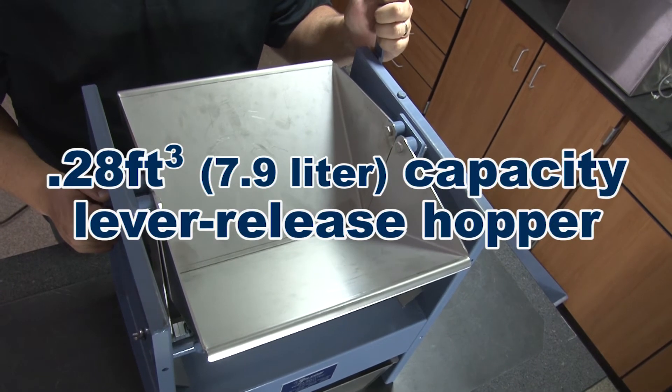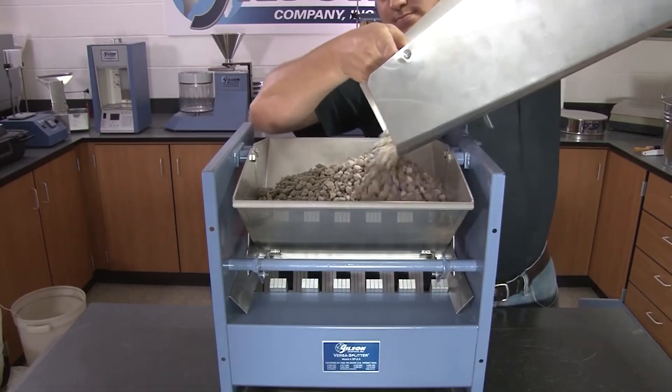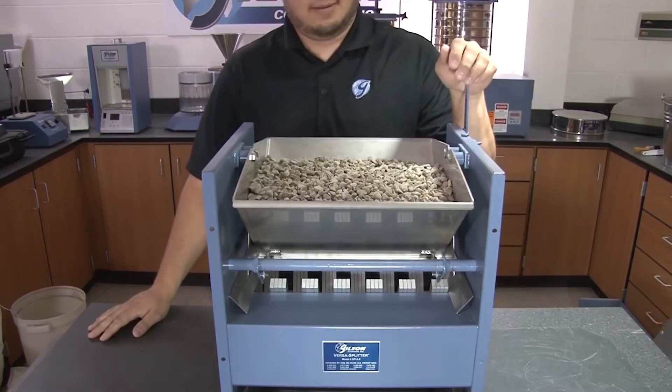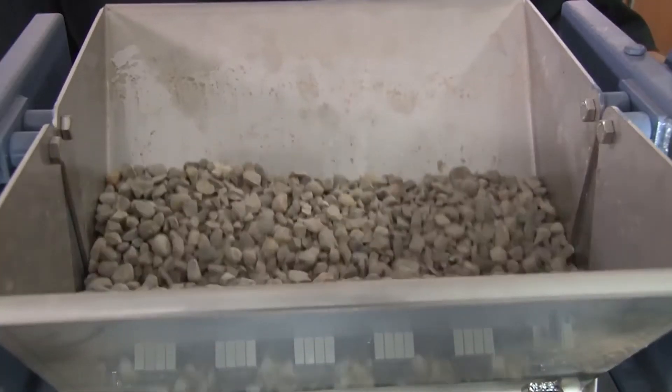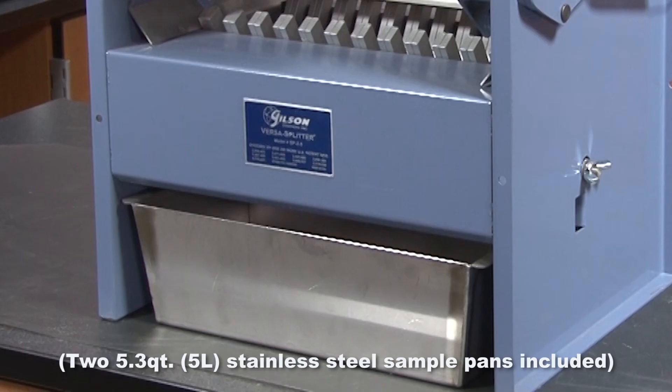The 0.28 cubic foot capacity lever release hopper remains closed until the bulk sample has been fully loaded and evenly distributed, achieving uniform dispersion of the materials through the chutes and requiring only two sample pans for proper operation.